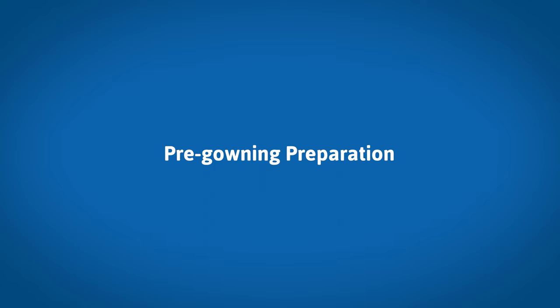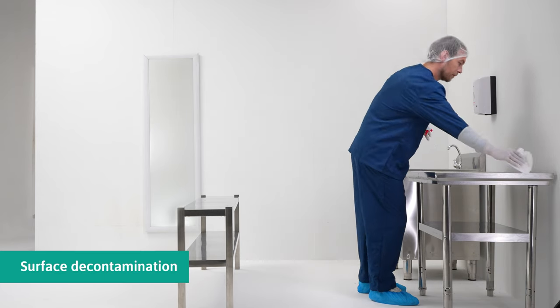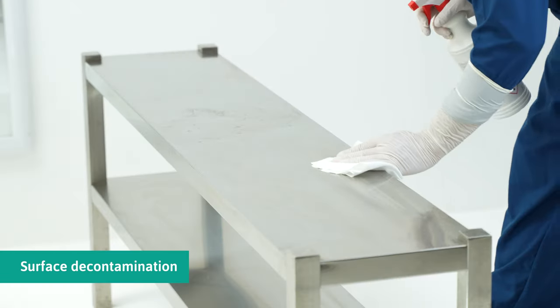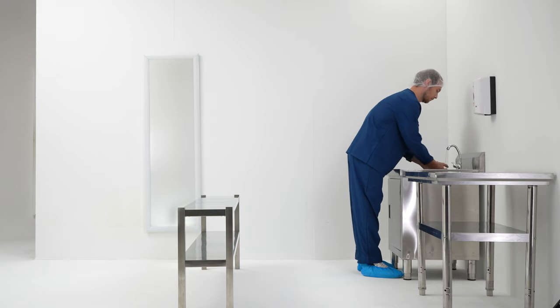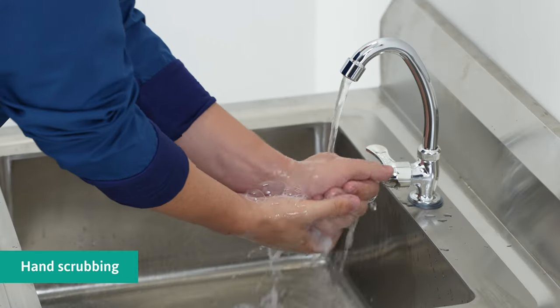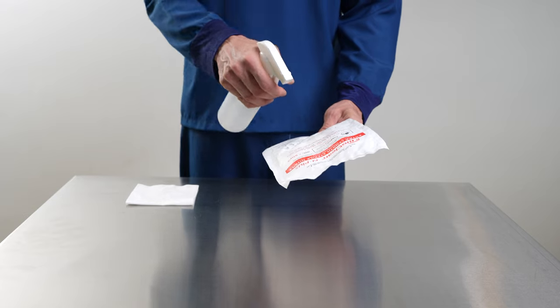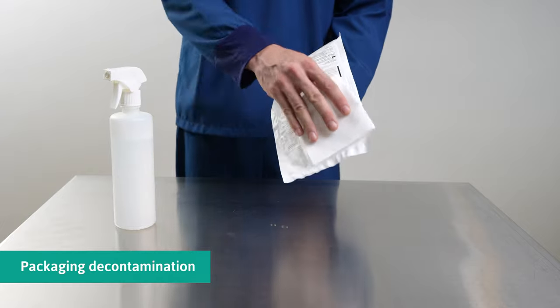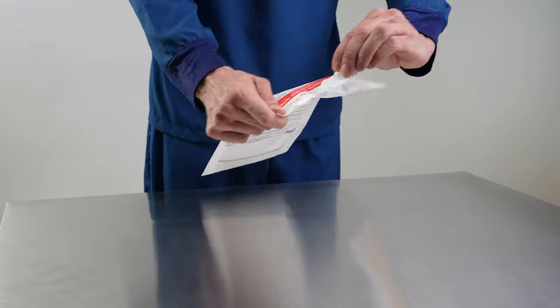Decontaminate the tabletop and bench with sterile wipes and alcohol. Use a new surface of the wipe for each wiping. Bare hands need to be scrubbed prior to donning the first sterile gloves. Wipe down the packaging using the sterile wipes and alcohol prior to retrieving the sterile content.